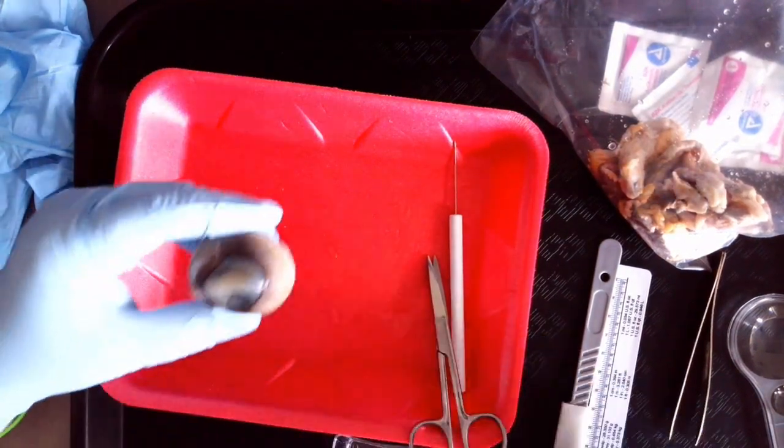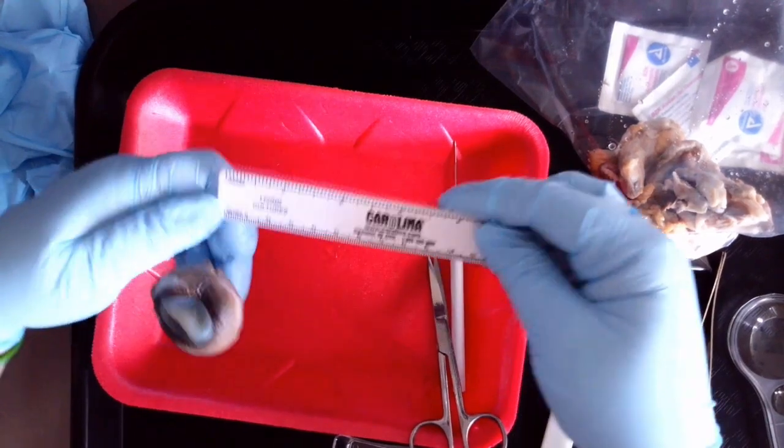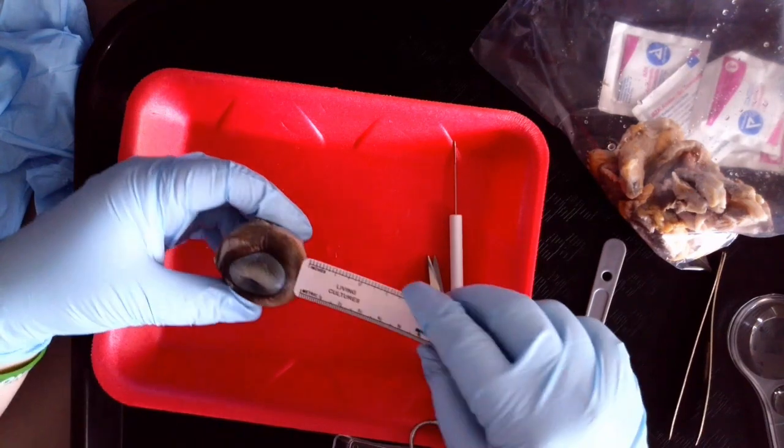The last thing you're going to do is use your ruler — we want to use centimeters — and we are going to measure the diameter.